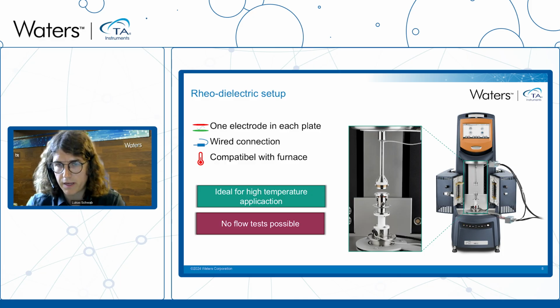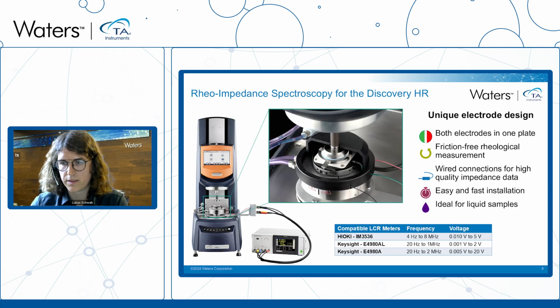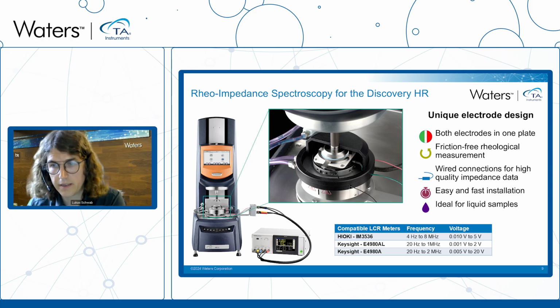But both of these methods limit the impedance measurement, and they also add additional noise to the rheological measurements. So that is not the ideal solution. So in this case, we came up with something different, which is first used with a Peltier plate. So this is ideal for liquid samples.